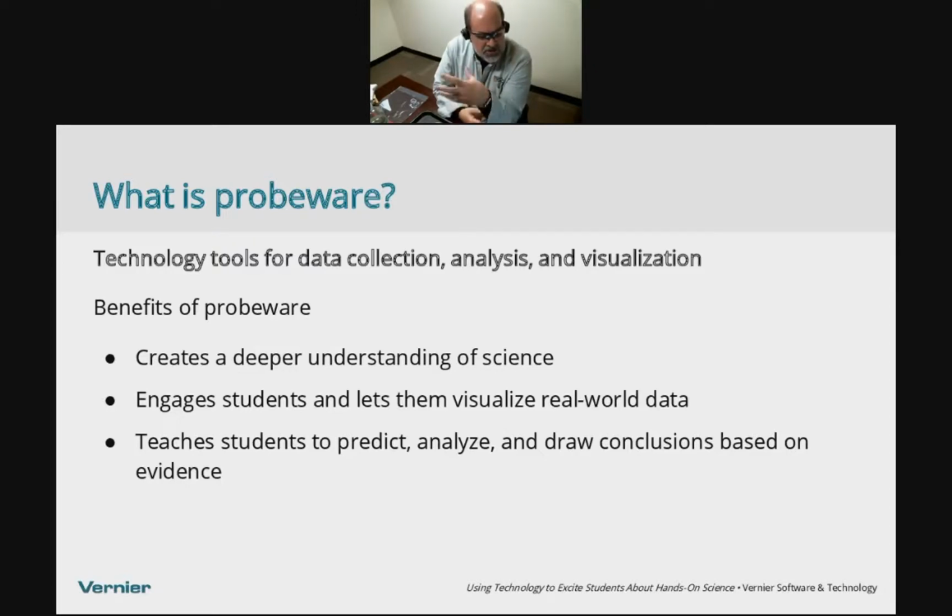And I'm curious to know what you guys think probeware is. For us, it gives the students a chance to deepen their understanding of science. Probeware is very engaging. You should have seen those fifth graders last week. The students very frequently love working with probeware. Teachers can use this to help students analyze data in a different way than something straight out of a book or on a worksheet. So that's kind of the basics of what probeware is all about.